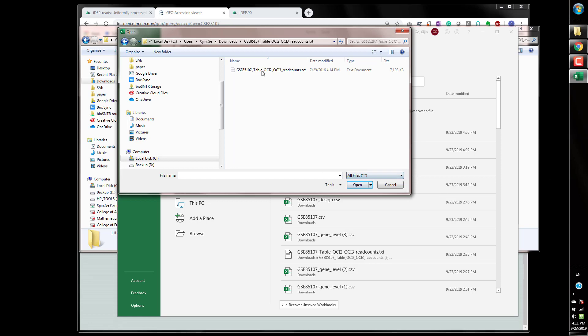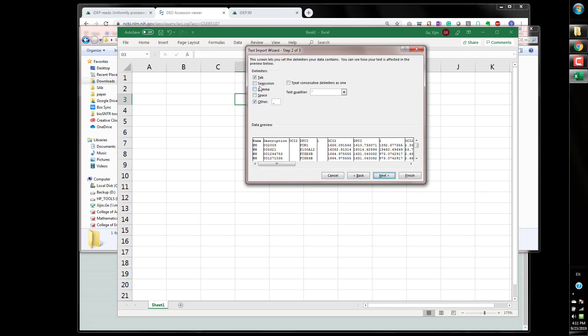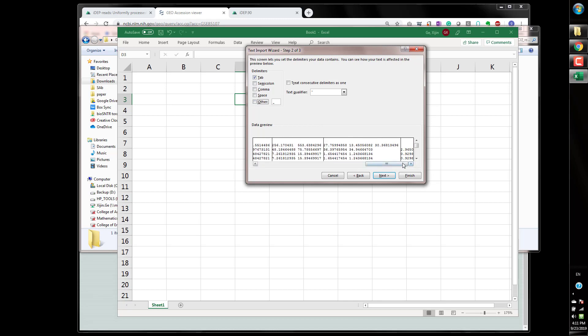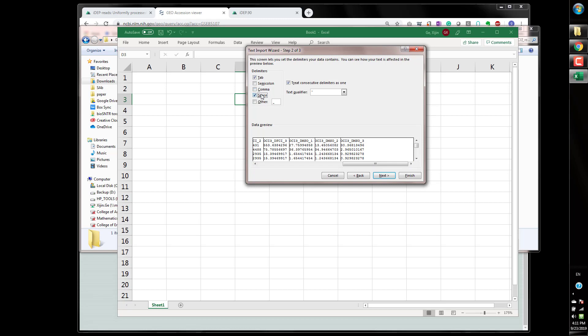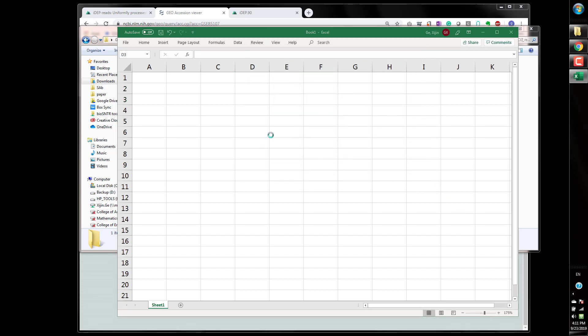You can open this file, all files and double click and this file is delimited that's for sure. And by default is tab but for tab you can see these columns are not separated nicely so I found you can change to space you can see these columns are separated pretty nicely.